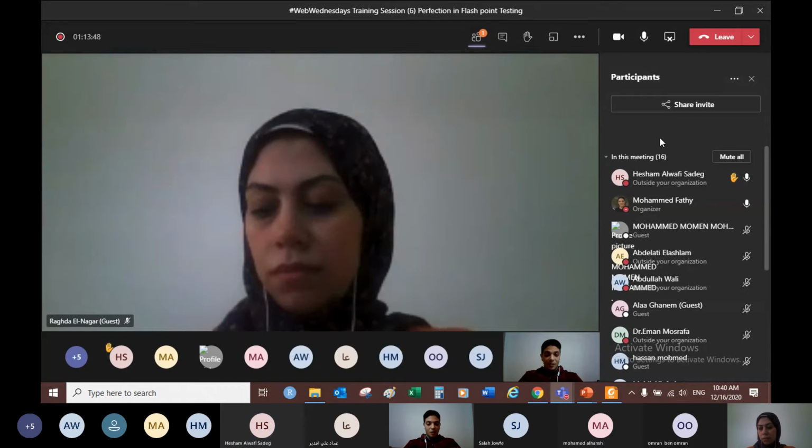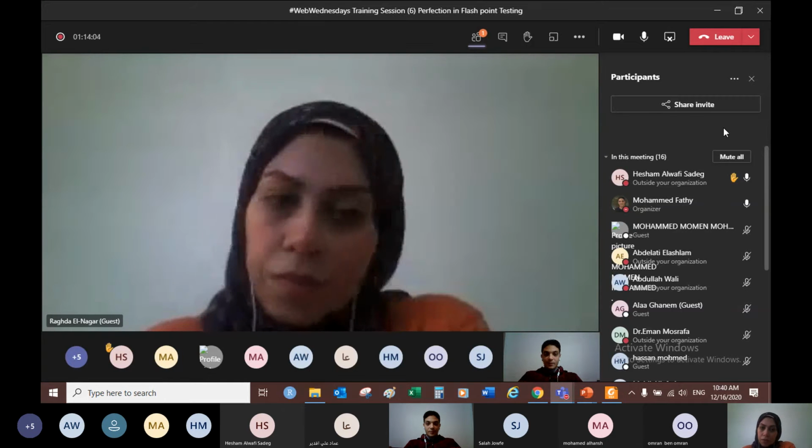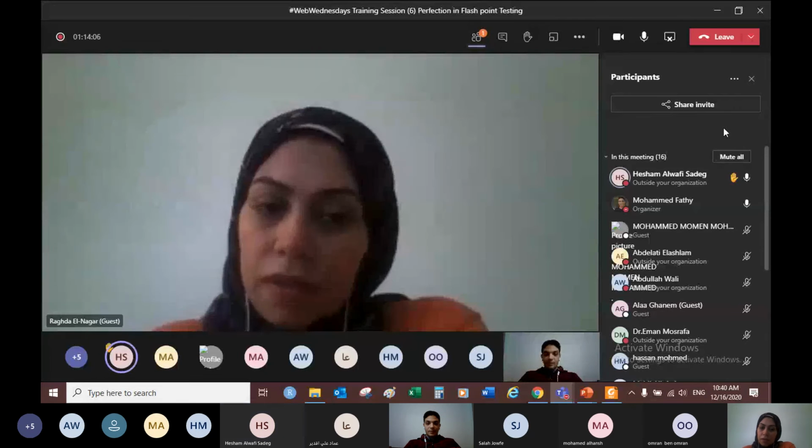Dr. Raghda, do you have any experience with the type of liquids used in these very low temperatures? Yes, in case of low temperature, it's preferred to use ethylene glycol because it has a wide range of freezing. But water will be iced. It can't be used.